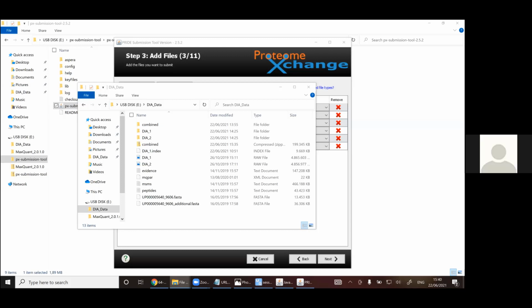Yeah, thanks for the nice introduction. I'm just wondering about whether these libraries, discovery libraries, will be available for other organisms. To start, we have these 10, 11 species, but we also have instructions on how you can make them for other species on our website available, if I am right. Okay, so that readme.txt has that info? Yeah, so we have a link, but we have just 10 species, as Hamid said, but not for all species. But totally correct.